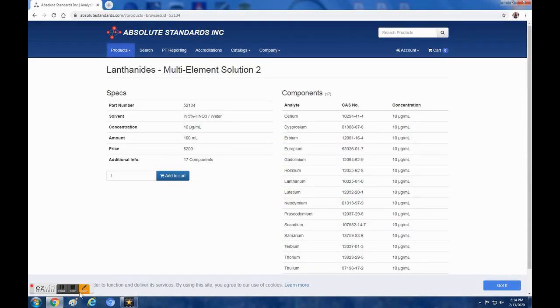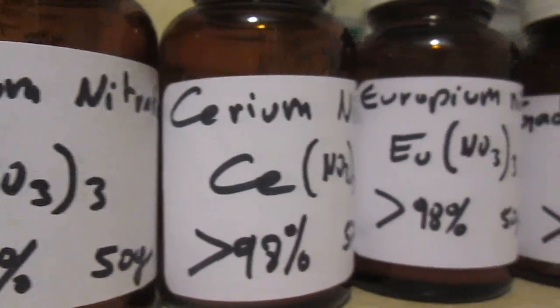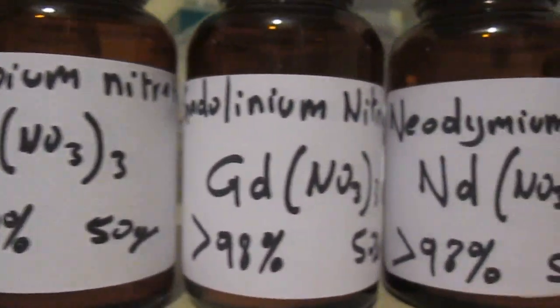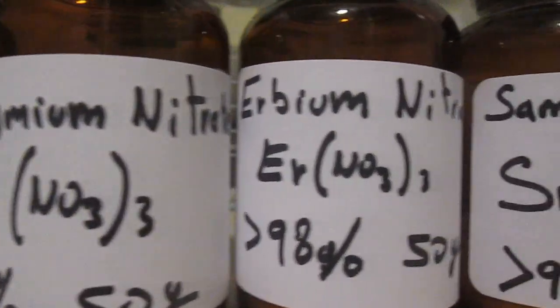Since lanthanide standards are more expensive than the equipment, I found a different supplier and purchased them individually, which allowed me to determine their retention time one by one.